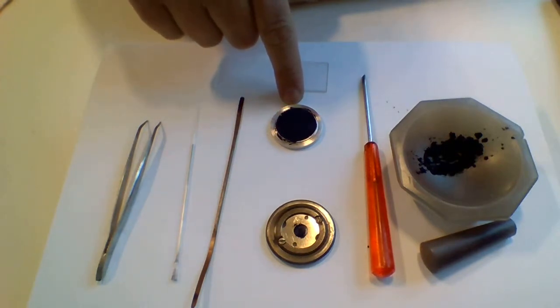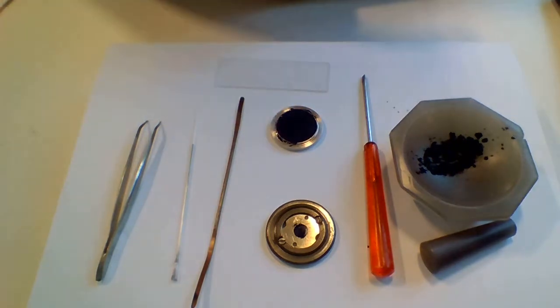We have the RIGACU, which is Bragg-Brentano, a parallel beam, so the idea is that the beam comes in and gets reflected from the surface.